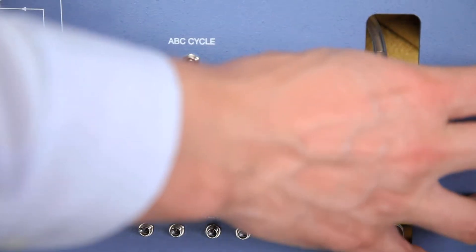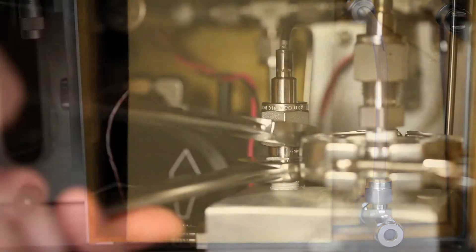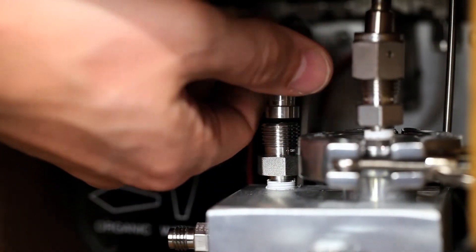Begin by opening the access door and removing the insulation. Now we fill the saturator, disconnect the VCO connectors, and remove the saturator.